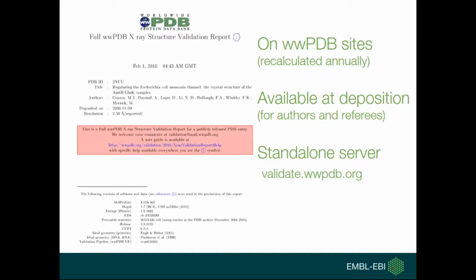So whether that's a homology model, where you can just look at the quality of the model, or you're refining a structure and you want to know how you're doing, then you can upload your files to that server and we'll give you a validation report.